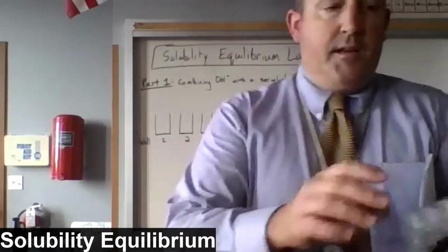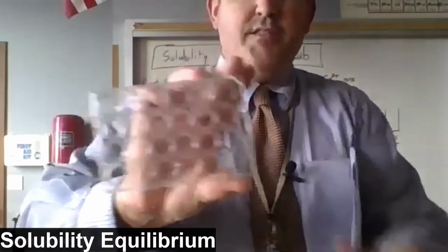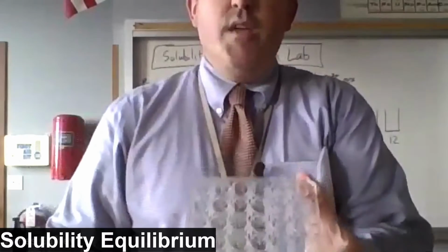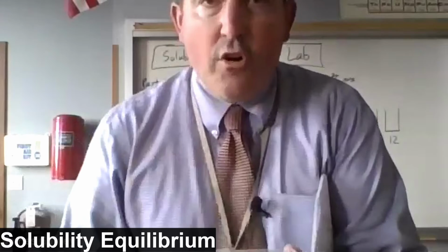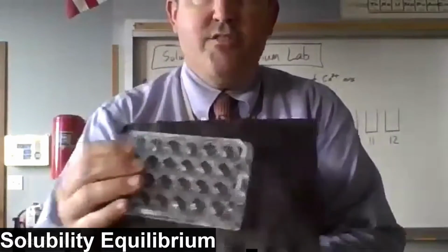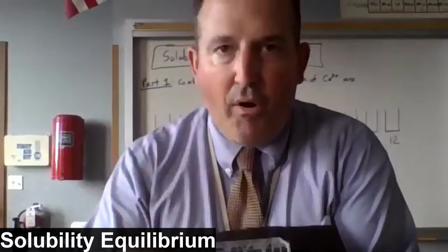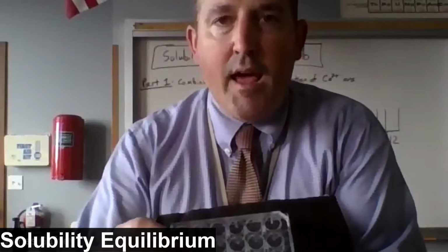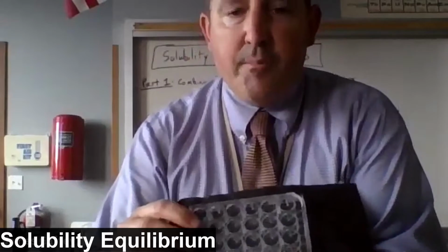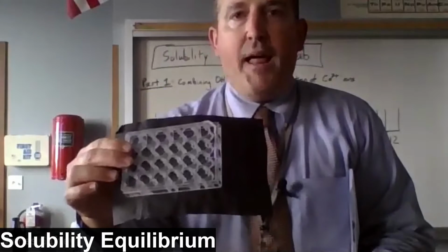We'll do the mixing in a chemical well plate like this, just a place where you've got several cylinders, several containers, to easily make mixtures and observe without having to get a whole bunch of beakers and things like that. I also have a piece of black construction paper, which serves as good contrast because the product of mixing calcium ion and hydroxide ion together is a solid white precipitate, calcium hydroxide. Well, a solid white precipitate shows up really well against a black background.